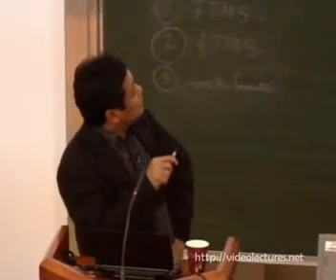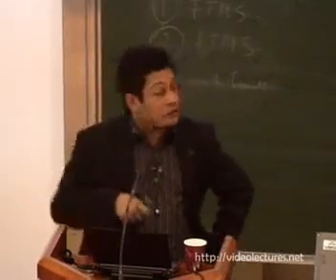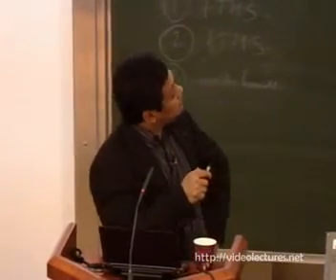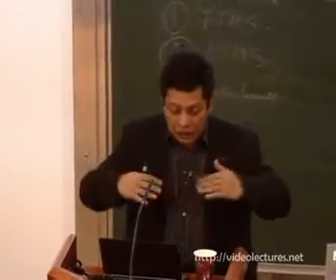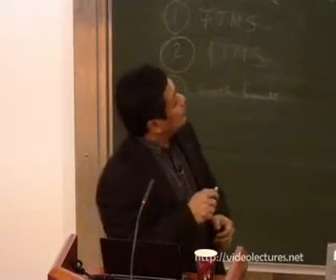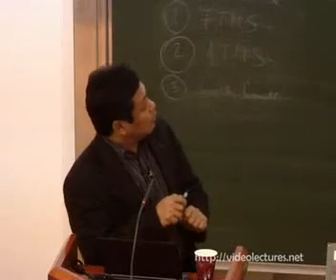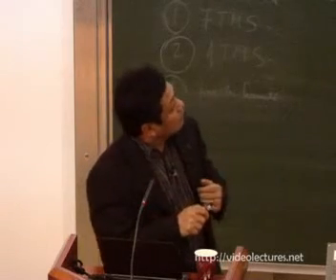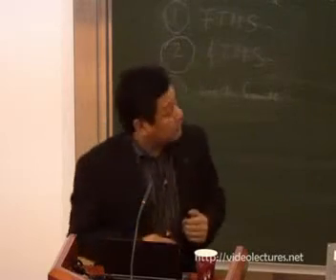As you would notice, inside there are wave-like patterns. This is caused by the electrons scattering from these atoms, because electrons have wave properties, so that you see this kind of standing wave pattern, and the wavelength is exactly half of the Fermi wavelength. And this is an important part of my talk, because we can engineer these electronic waves for our applications.